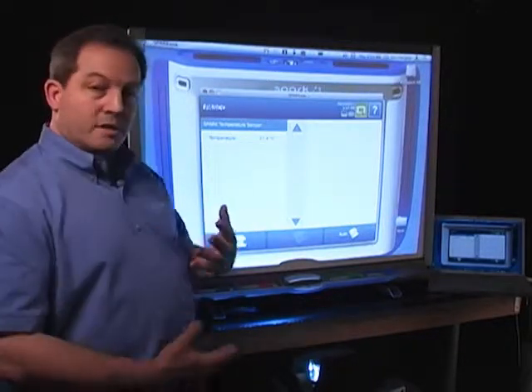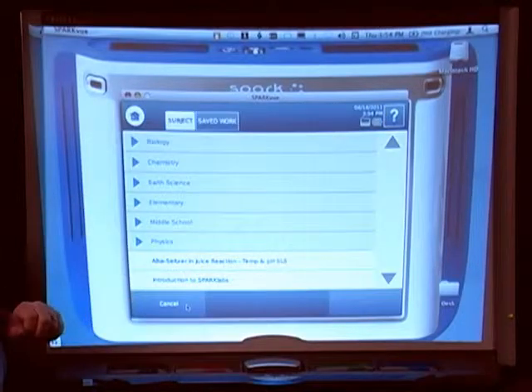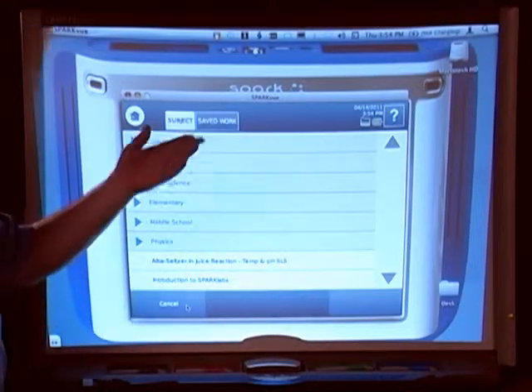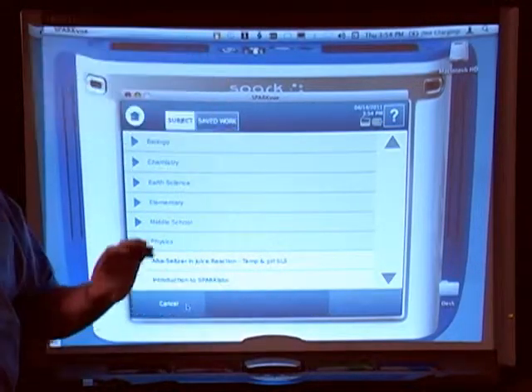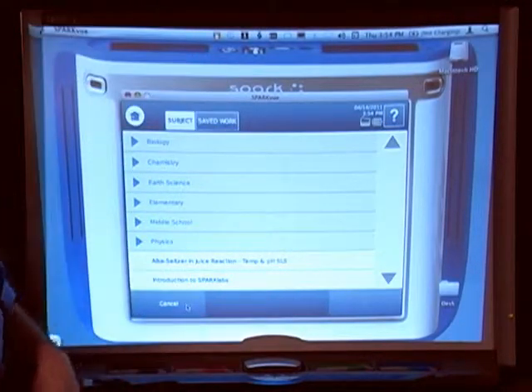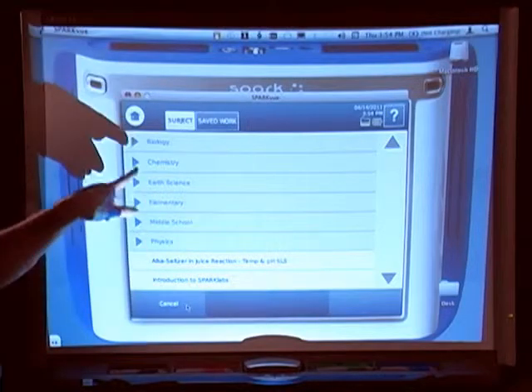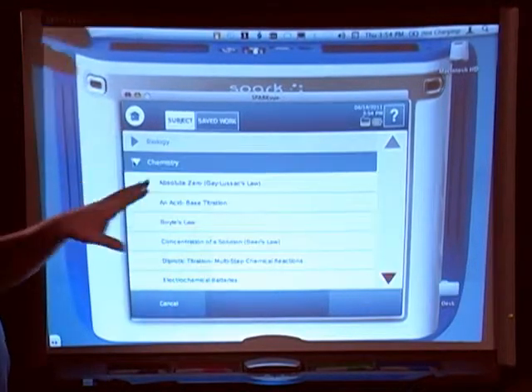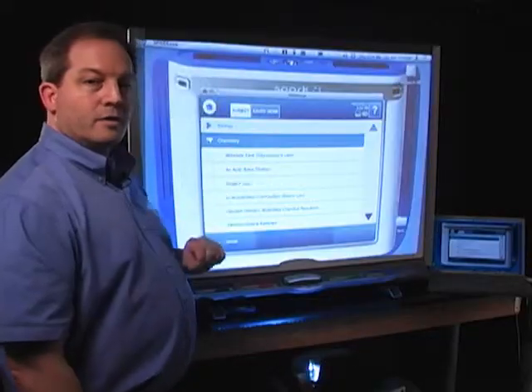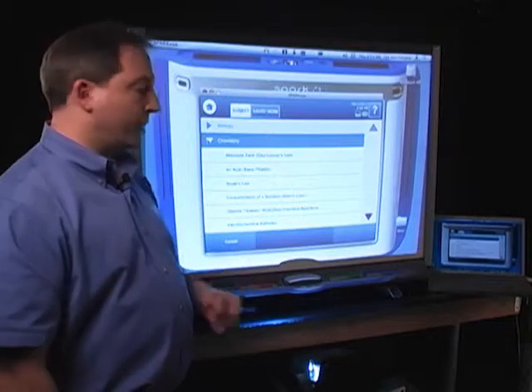So, for instance, if I was going to open something like a file, I get the same list of files that I would on the device. And if I have my students following along, they can go touch for touch and open those files and do exactly as I want them to do on the device.